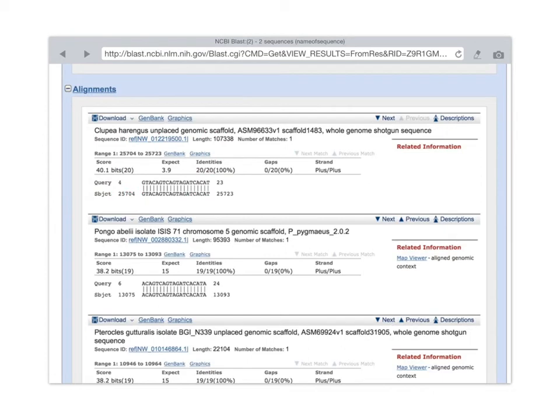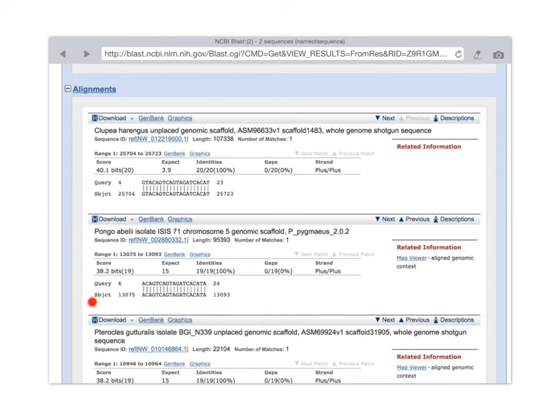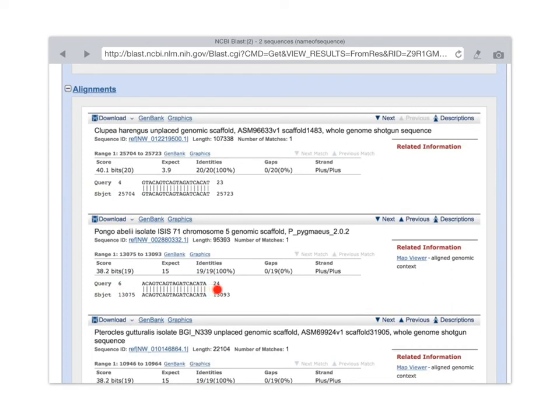To take one more look, let's look at the Pongo abelii genome. Pongo is orangutans, if I'm not mistaken. Or is it chimpanzee? I better go look it up. Here we see a similar result. From our sixth nucleotide through the 24th, there's a perfect match to a region of the Pongo abelii chromosome 5 sequence.